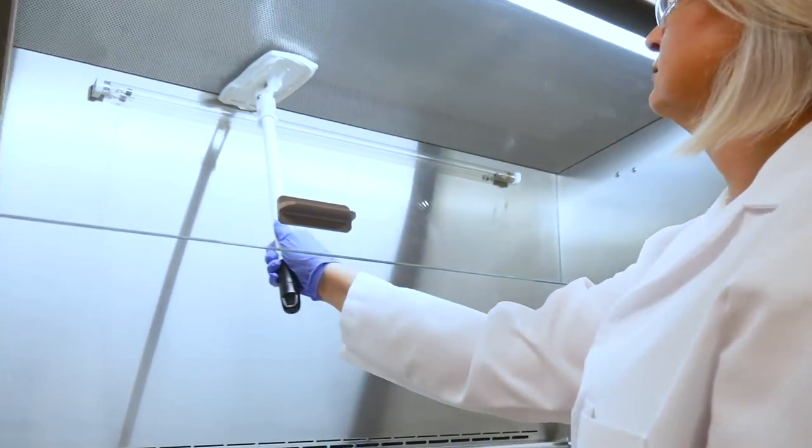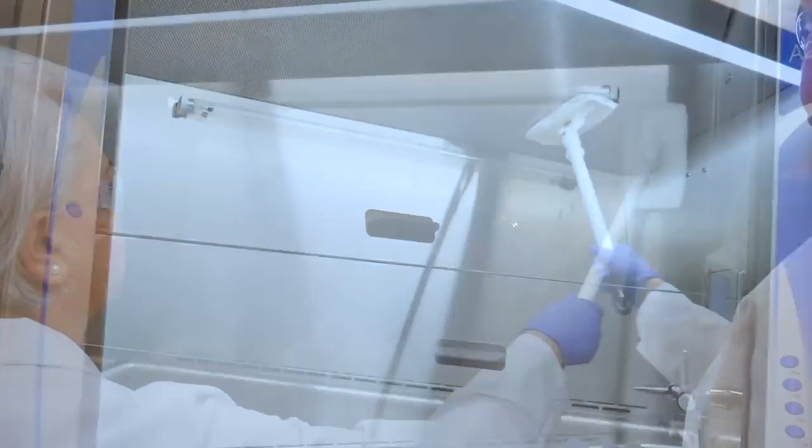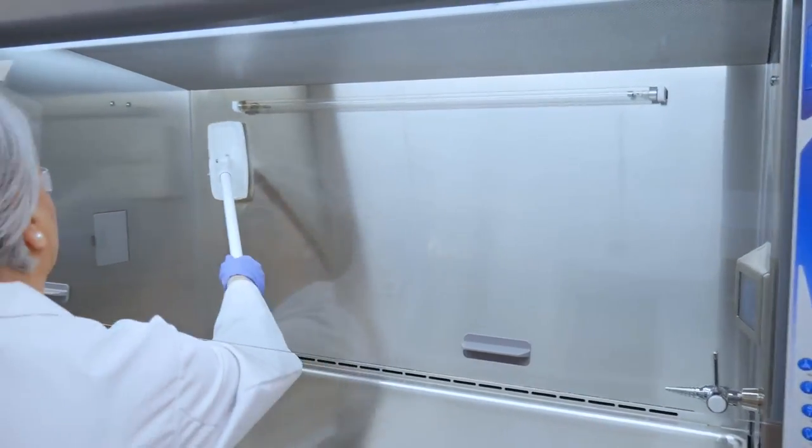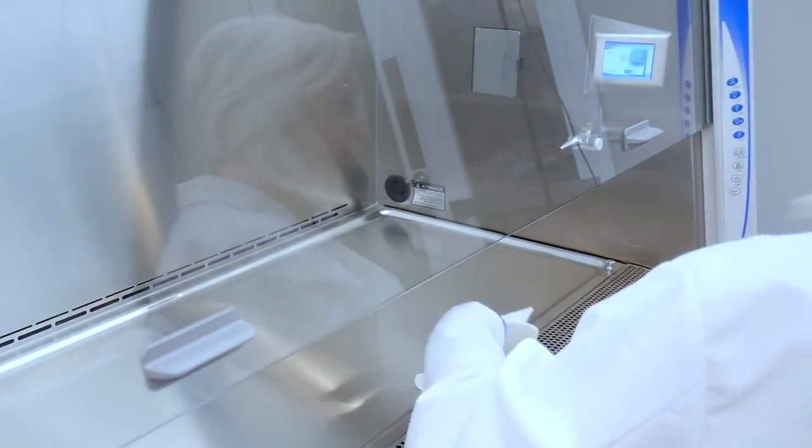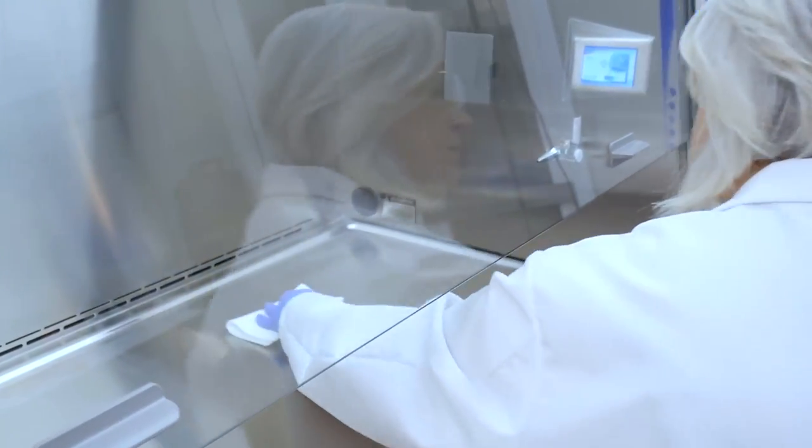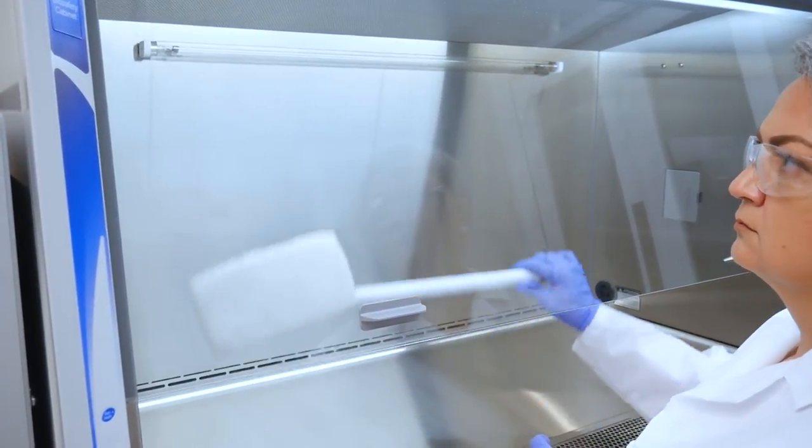Wipe top to bottom and back to front, overlapping with each pass. Use caution when working with disinfectants that contain chlorine, such as bleach. These solutions may corrode the interior of the BSC and when used should be followed by a secondary cleaning with 70% IPA.